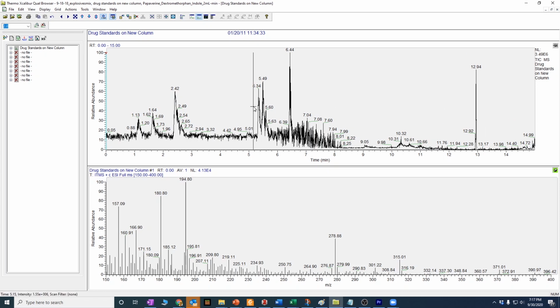All right. Now I'm operating here at pretty low concentrations of these drugs and metabolites. So the signal here is what's called the MS1, a little bit less sensitive, still way more sensitive than UV. But I'm getting a lower signal to noise here, and there are tons of ways for me to play with this chromatogram.